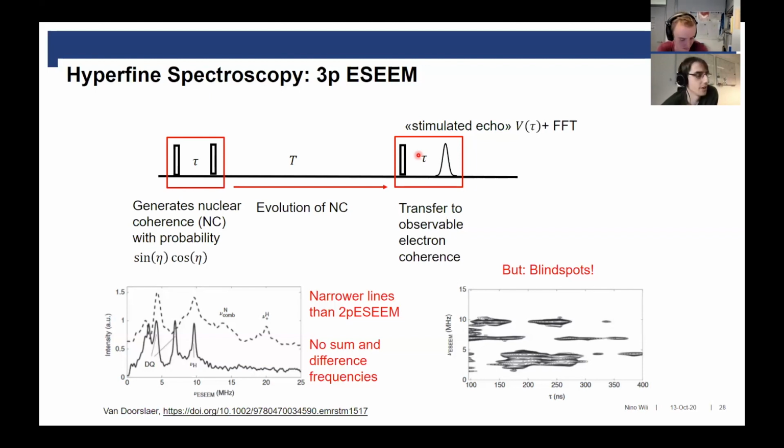Okay, great. Okay, well, it doesn't look like there are any more. Okay, I do have another question from an anonymous attendee. What is a typical T1 rho in EPR? And can you use spin locking for magnetization transfer in EPR?